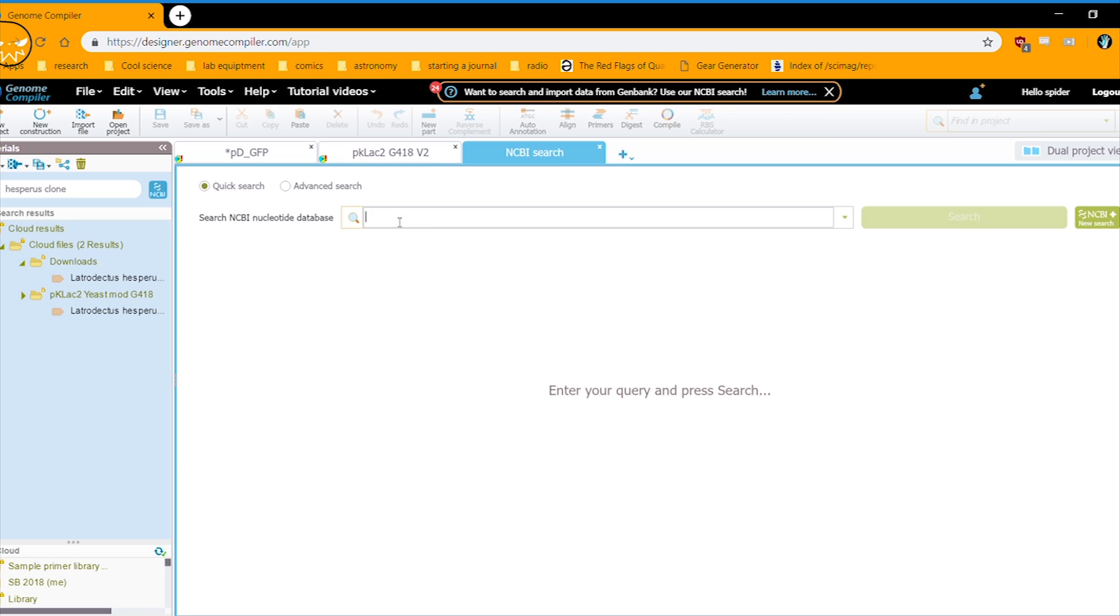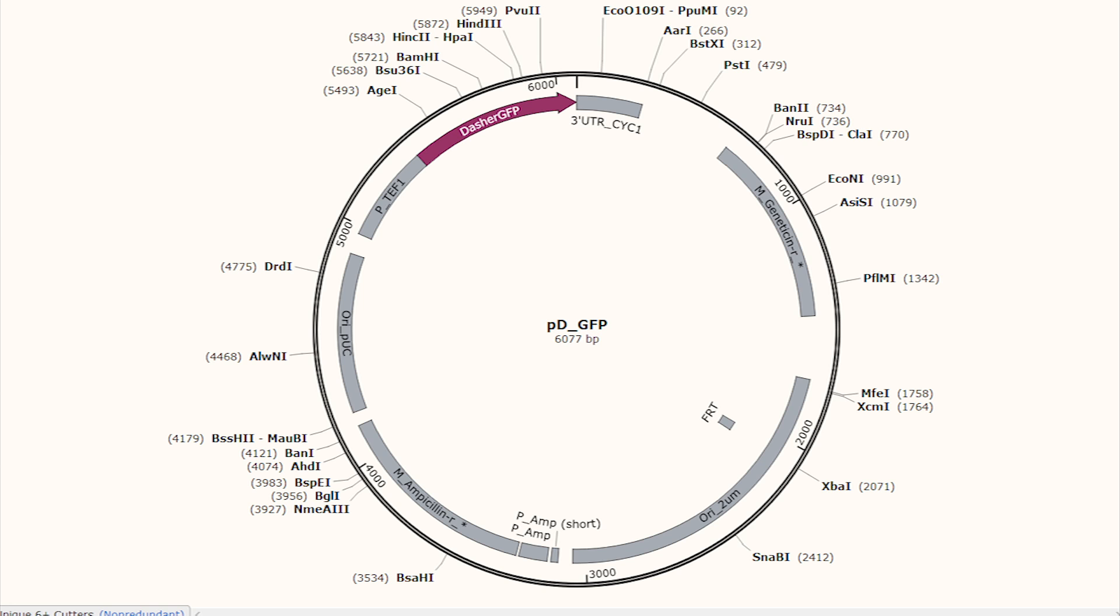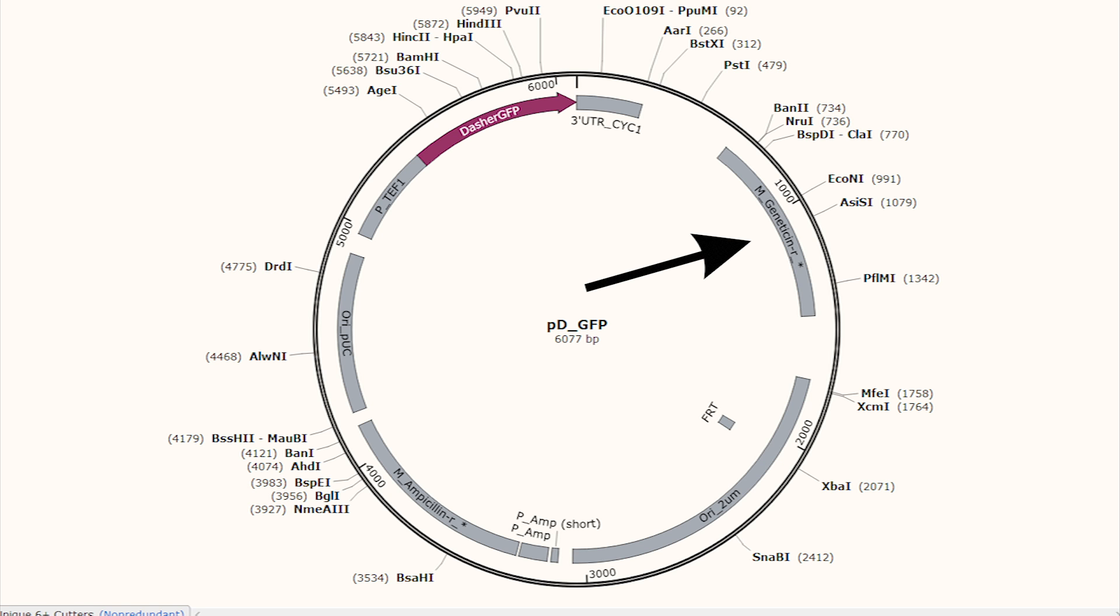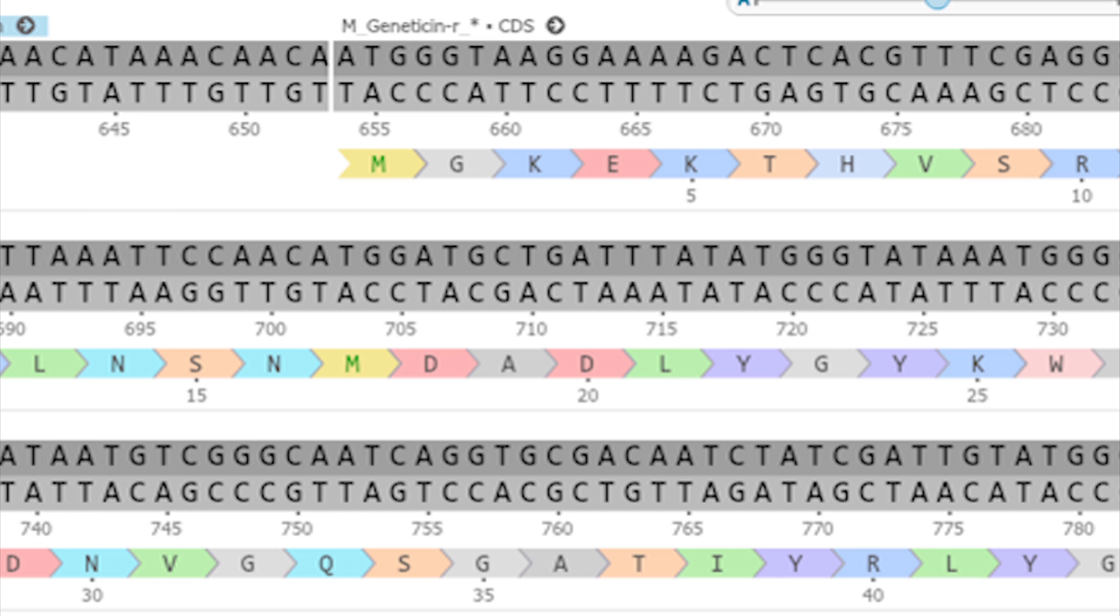If you don't have the DNA sequence but it exists in the NCBI or iGEM databases, there's a search function that lets you import it directly into the program, which we'll look at in a moment. The piece we're interested in is the G418 resistance gene. We want to copy it out so that way we can put it into our main PK-Lac2 plasmid, so that when we make our spider yeast we can select them using G418 as the antibiotic. So we need to design the primers that will stick to the start and end of this sequence. Let's look at the start of the sequence.